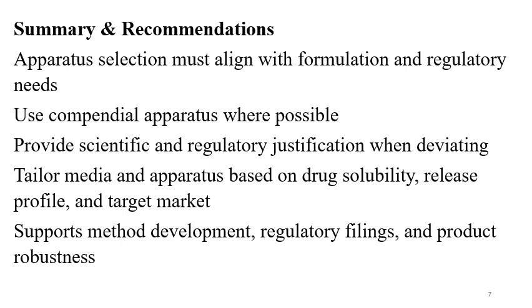Always have data from two different apparatus for the test formulation and also for the reference formulation. Generally, you should perform dissolution testing on 12 units so that you can get a clear idea whether to go with the same apparatus or whether to go with a different apparatus.